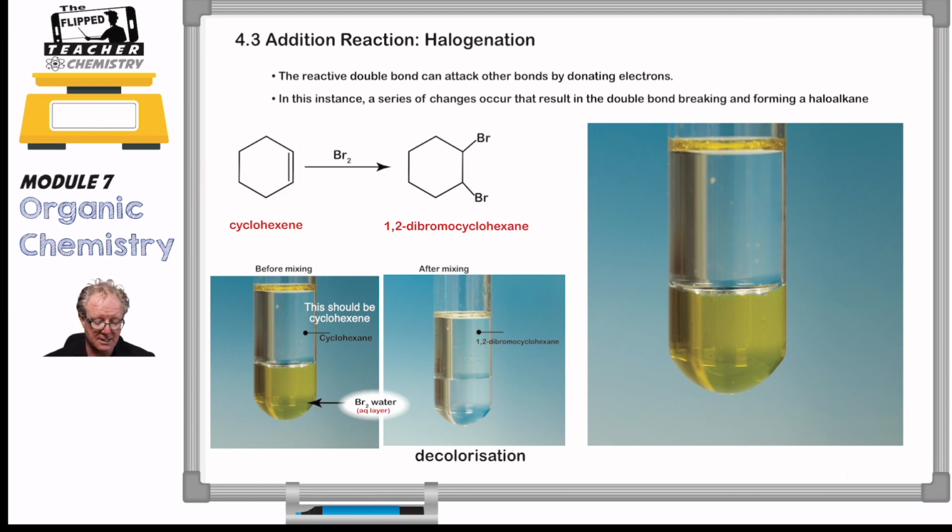This one's cyclohexene. We use cyclo compounds because they're less carcinogenic than the straight chain equivalents. So cyclohexene is a little bit safer to use than just straight hexene, and so we use that in the lab. Of course, the precautions that we need to take, being organic chemistry, we need to do this in a fume hood. We need, of course, to wear our gloves, our lab coat and our glasses, etc. And we're using small volumes. All of those factors are taken into consideration to make this reaction a lot safer to do.